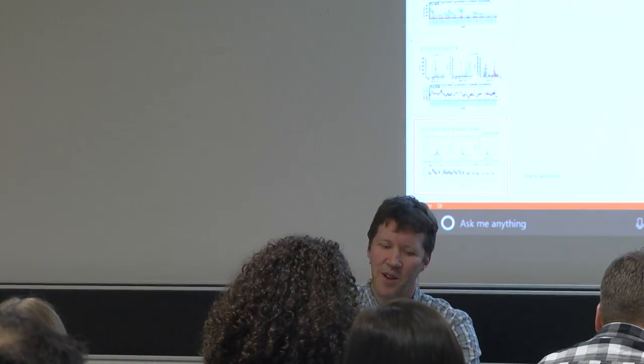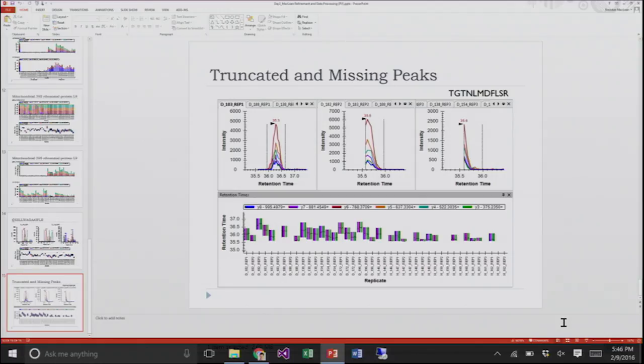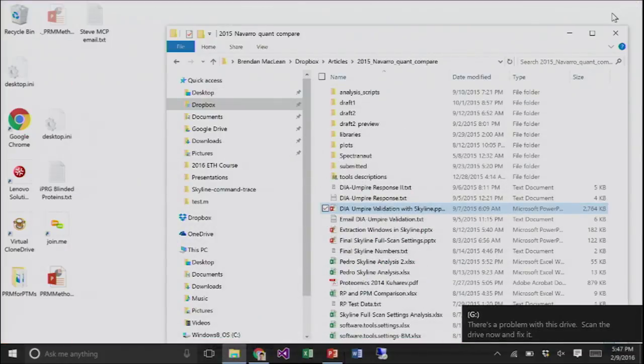So everybody should have their thumb drive. You can plug it into your computer, and we're going to grab the data set. There's actually a full tutorial on this data set now. For a long time I was teaching this data set, and there was no tutorial.